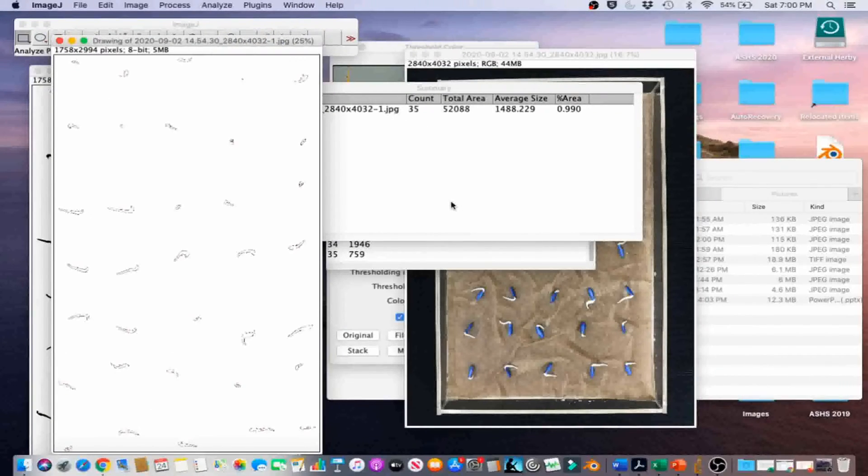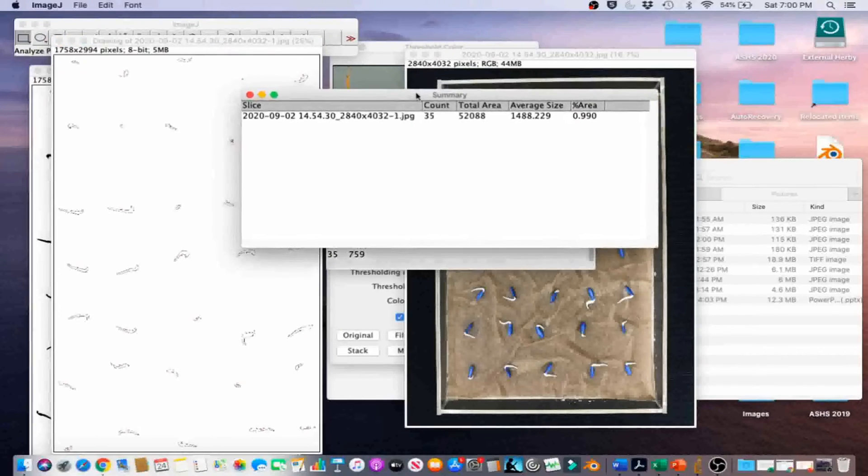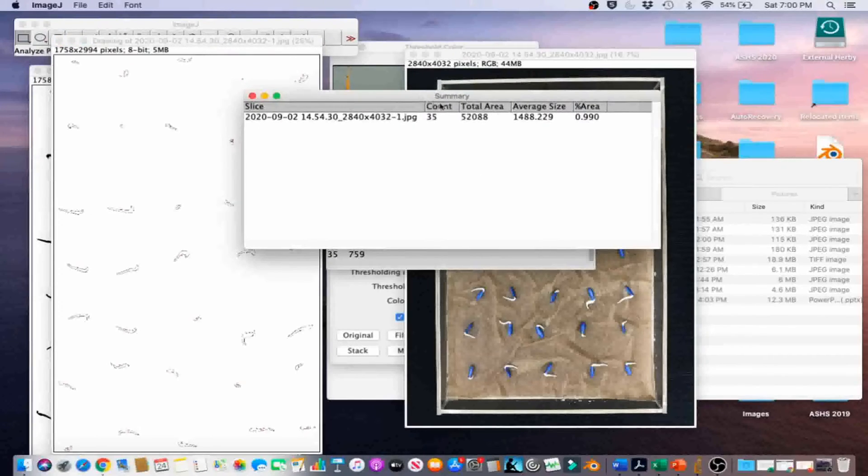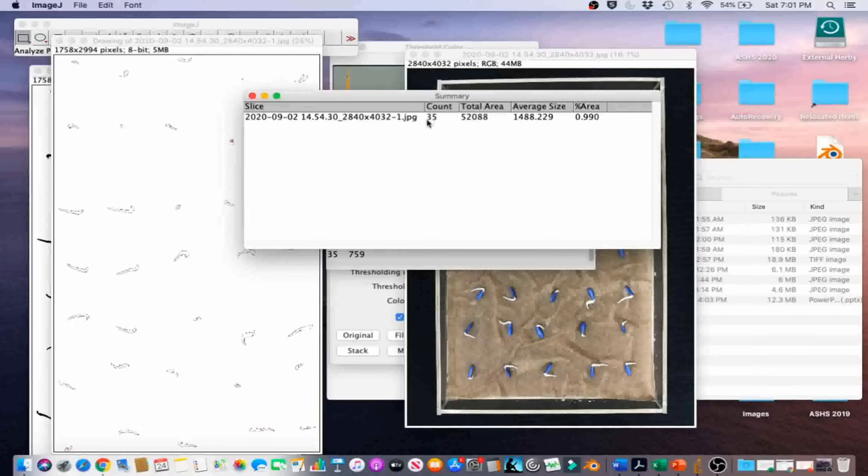The number of seeds with emerged radicals is in the summary table under the count column for the sake of measurement. If we wanted to figure out the number, we could just go ahead and record this value right here.